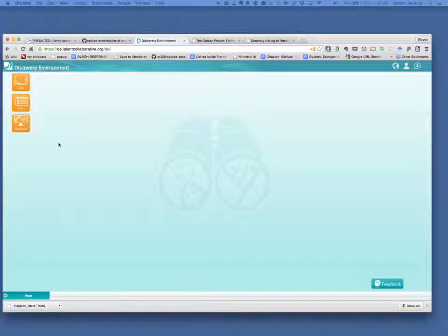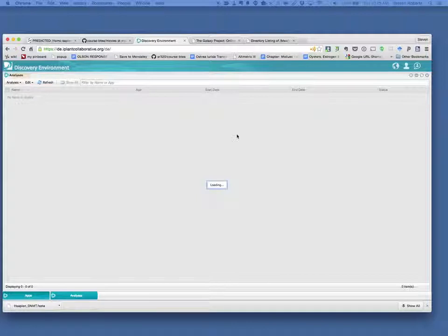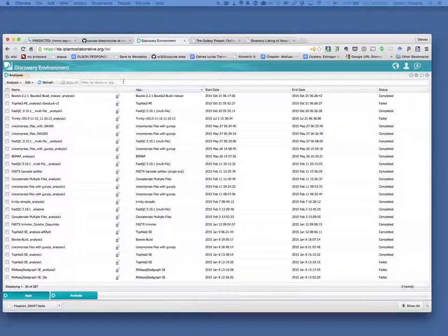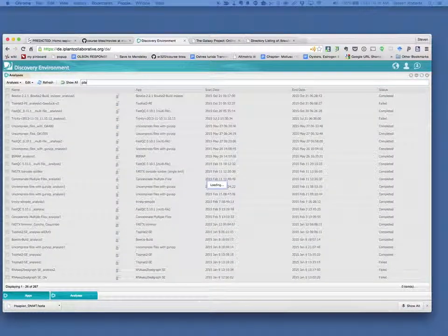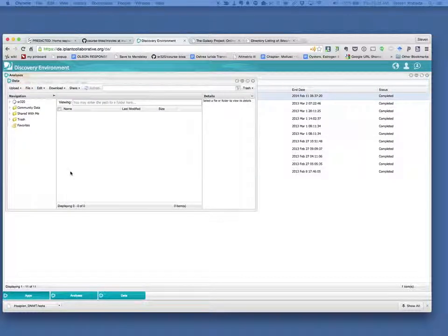So the other thing, once you run those jobs and they're finished, they show up here. This is your analyses. Okay? And I've got a lot. You could see Trinity and a bunch of other stuff going on there. So I just searched, and these are results. Okay, so the results are just spit out in a file.